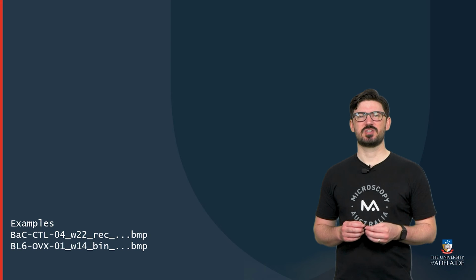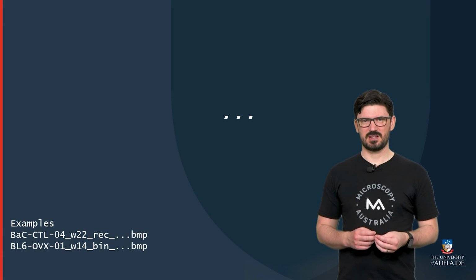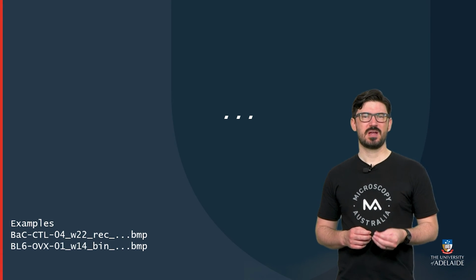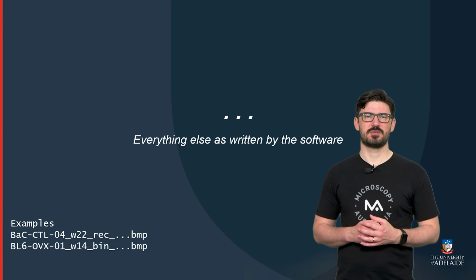We then amend our examples as necessary for raw and binarized images respectively. Now, there's still one aspect of the naming convention that I've deliberately overlooked, but you may have noticed in my naming convention the ellipsis, or what you may call the 3 dots. I've used it here to note the omission of certain attributes in the convention. Those are attributes often beyond your control that are decided by the microscope at the time you generate your image files.